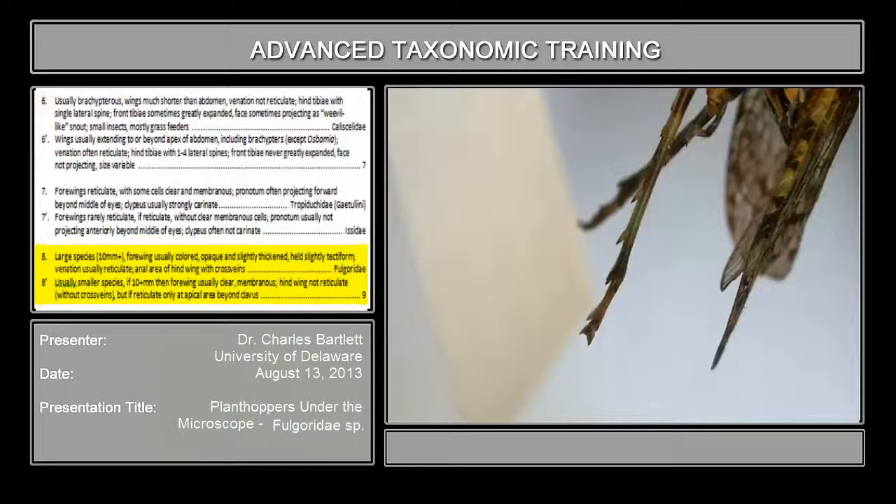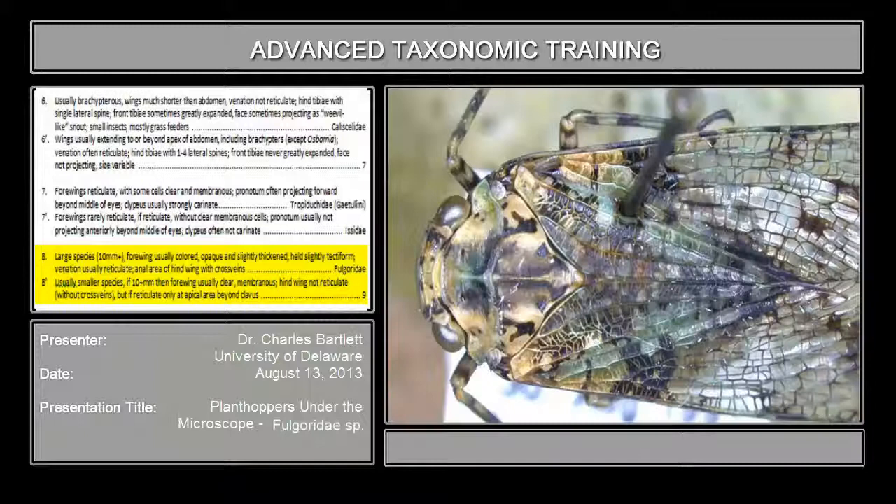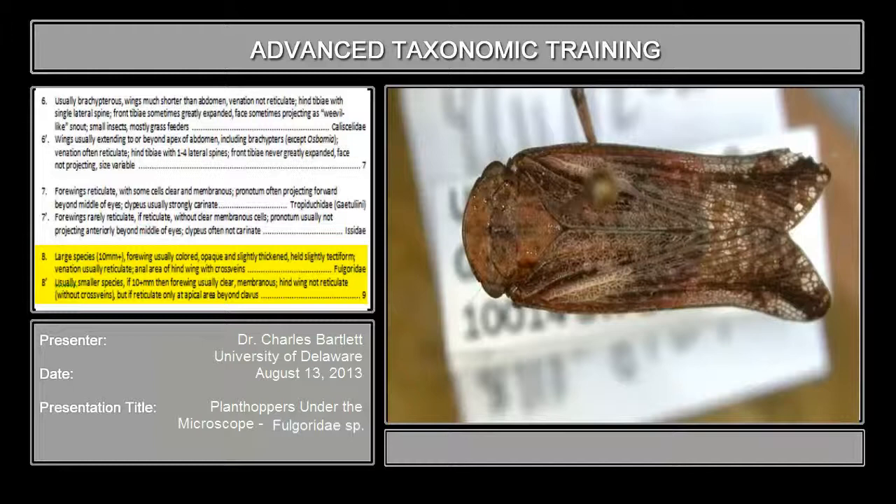This specimen is large enough that I can't get it all under the scope, so I would say that constitutes a large species, more than ten millimeters. Front wings are normally colored, and you can see in here that it is colored. This is actually much less colored than many of them are. For example, looking at this one, these four wings are very distinctly colored — so that's what we mean by that.